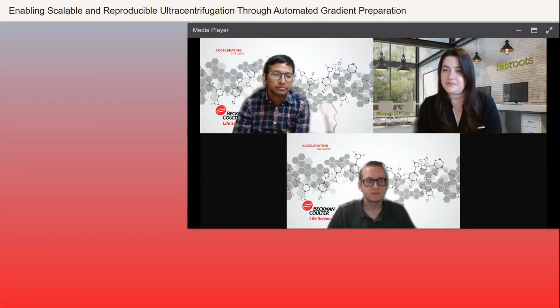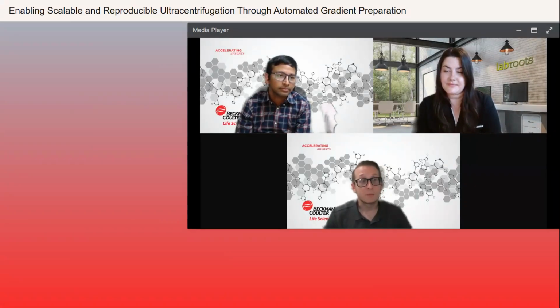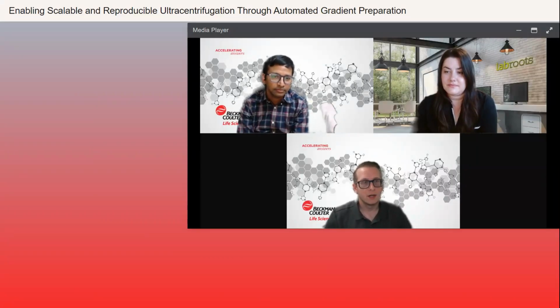Wonderful, thank you. Okay, our next question for you, Shawn, is the OptiExtract automated? Okay, OptiExtract was the sample recovery tool that Bala showed towards the end there. Short answer for that is no.